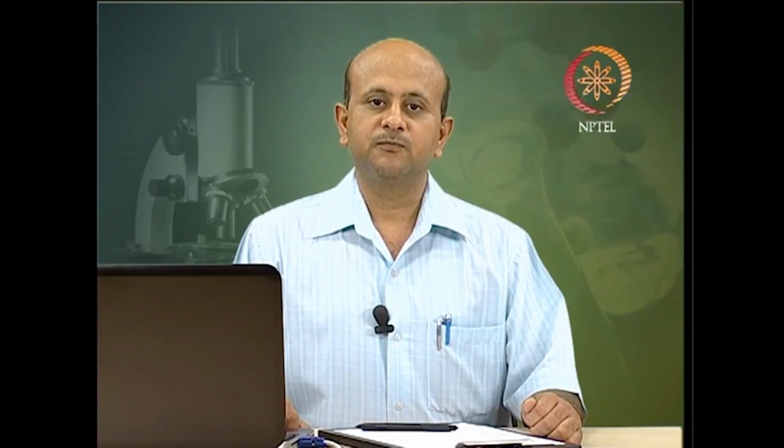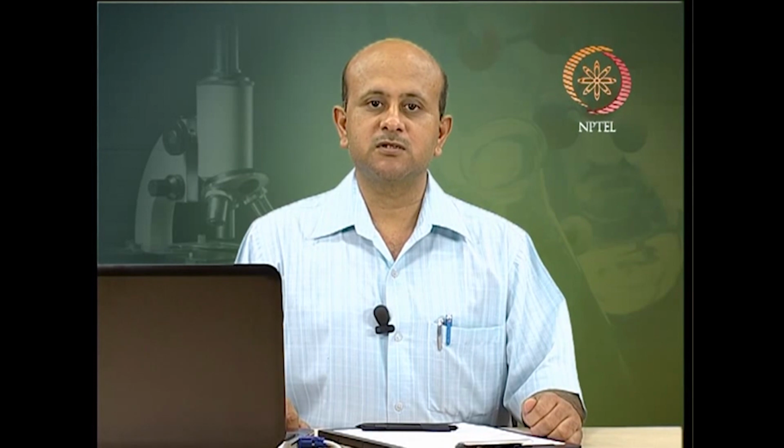In this lecture, we are going to extend our discussion to the different types of centrifuges, the types of rotors used in these centrifuges, and then the care and safety aspects of centrifuges as well as the rotors used in them. We will be discussing all these things in coming lectures. In this lecture, we are going to discuss different types of centrifuges used for various applications.